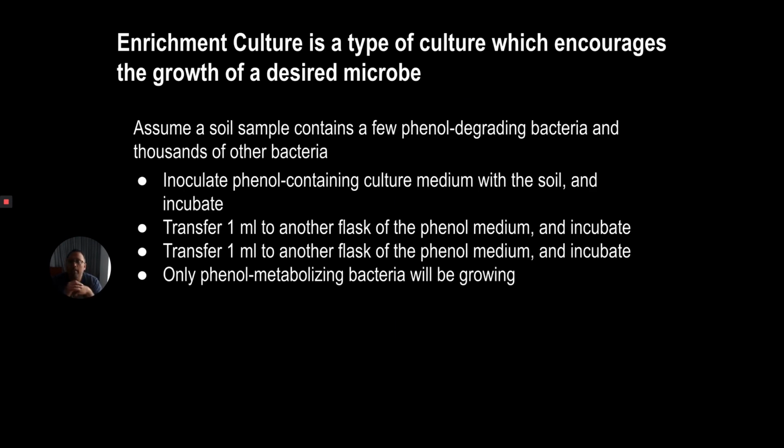Then we have enrichment culture. It's a type of culture which encourages the growth of a desired microbe, right? Again, we're not keeping anybody from growing, but we are creating an environment that enriches the growth of one versus the other.